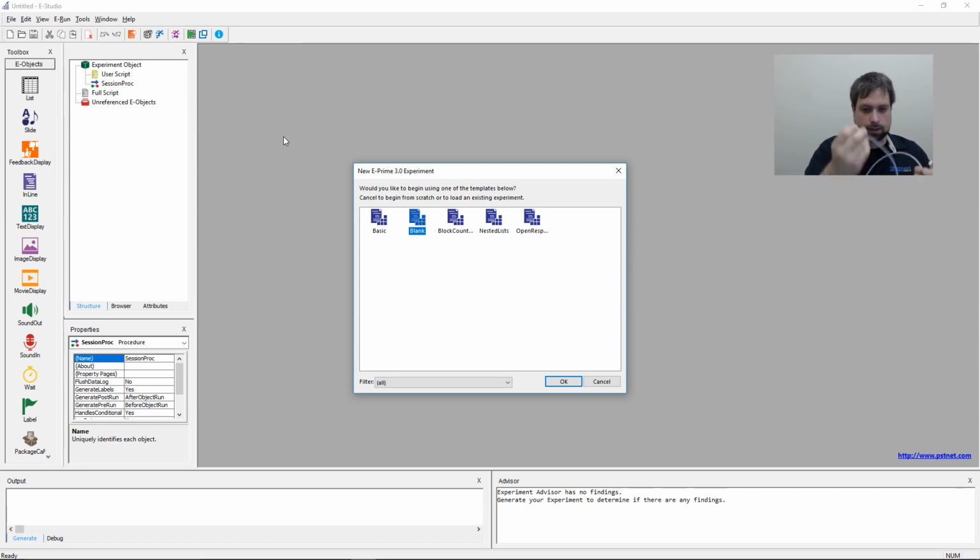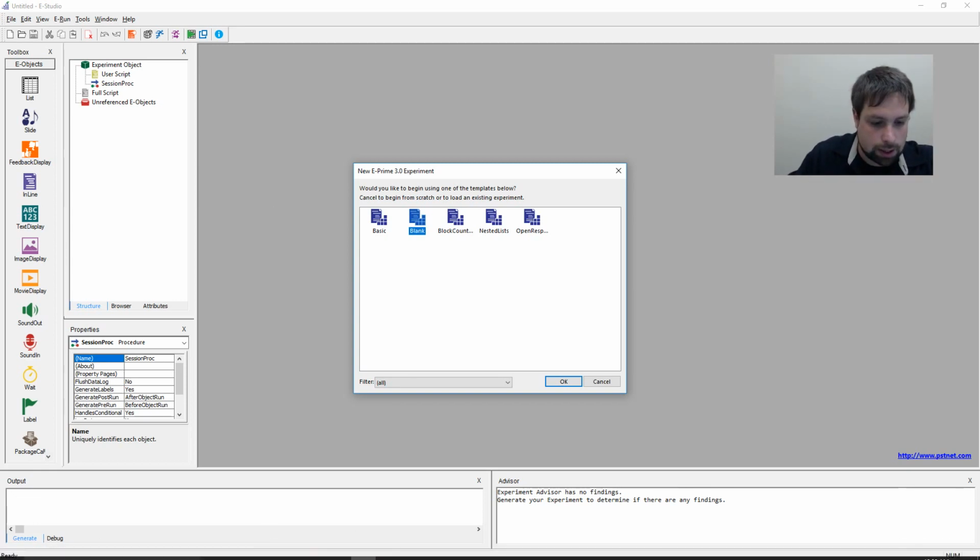Now this is something that we had made in-house. This first gray part here is our Kronos aux I/O cord, and all we did is take the loose wires here and put them into this DB25. So with this, I get two digital ins to send signals to Biopac and two digital outputs. And we actually have a really good chart that I'm going to show you in a second. So the chart is here.